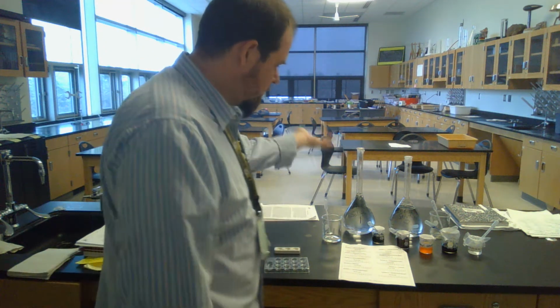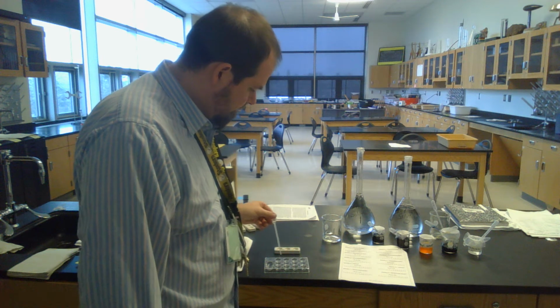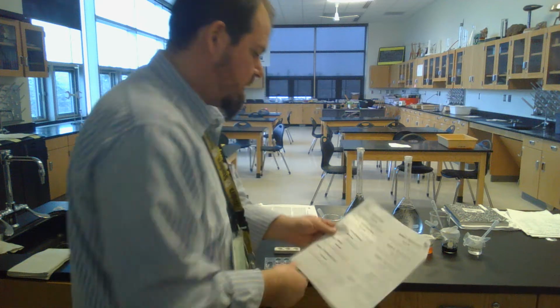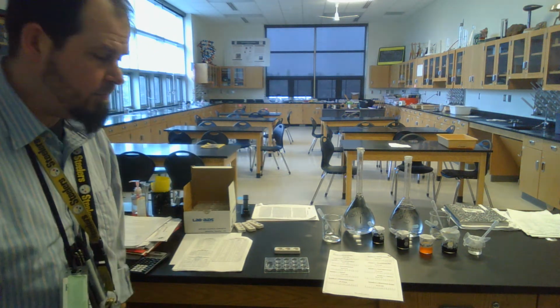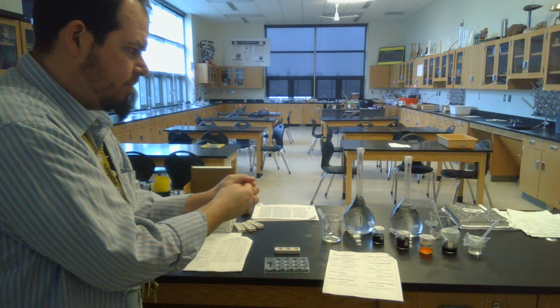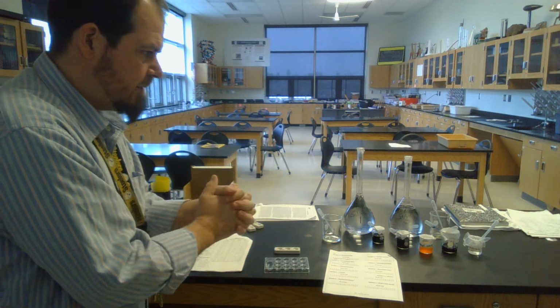So I'm going to take solution 1, say, and I'm going to go ahead and draw some up, and I'm going to go 4 wells, pop, pop, pop, and 1 well into here because I have 1, 2, 3, 4, 5 indicators that we're using. And there are the 5 indicators. You see them? They're all labeled. They all have the parafilm down, trying to keep them from drying out as much as possible. Okay, so I want you to keep them as pristine as possible.